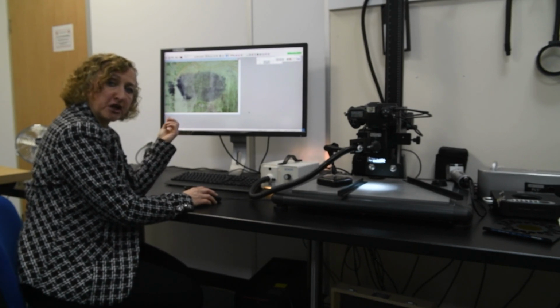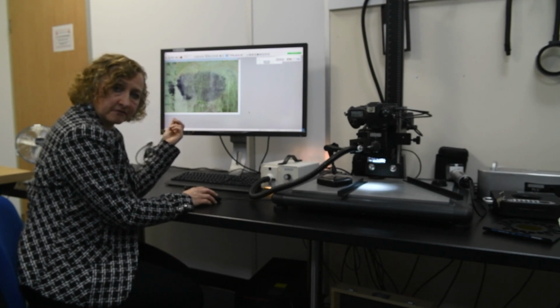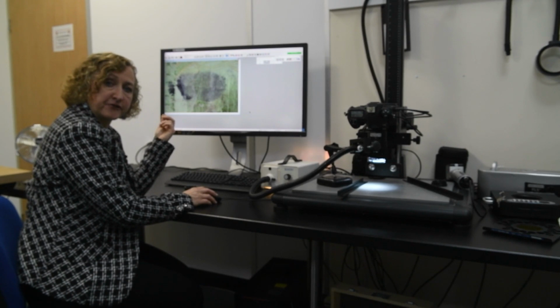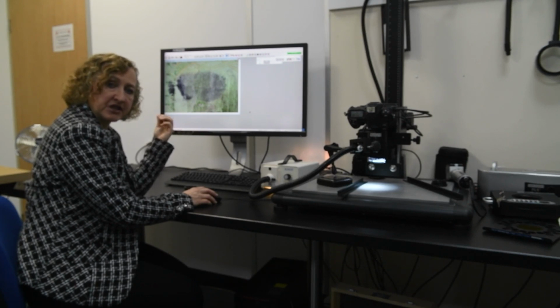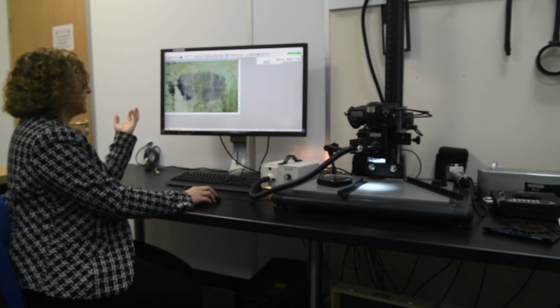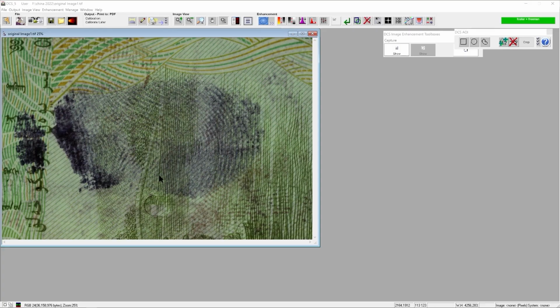So we're going to show you a technique that uses the color models for background subtraction, as well as using Fourier transforms at the end after the color information has been removed to finalize the image enhancement process. So first of all, we have in this image diagonal lines running through the fingerprint, as well as an irregular series of patterns running in the vertical and in different directions through my image.